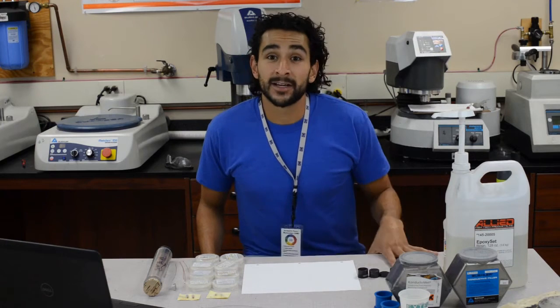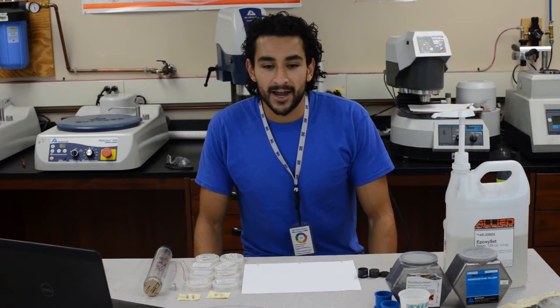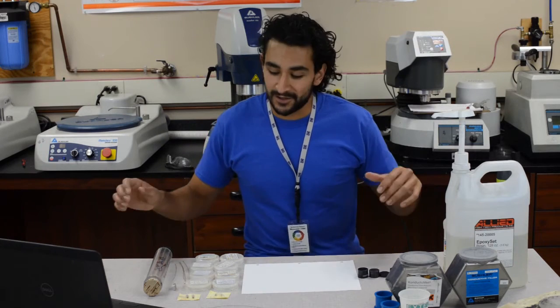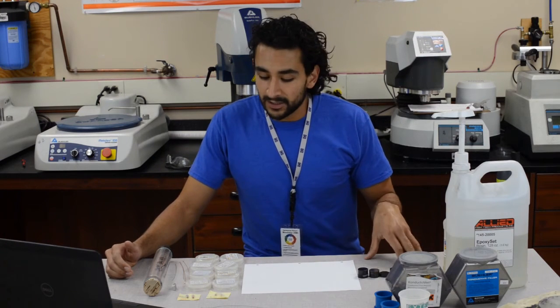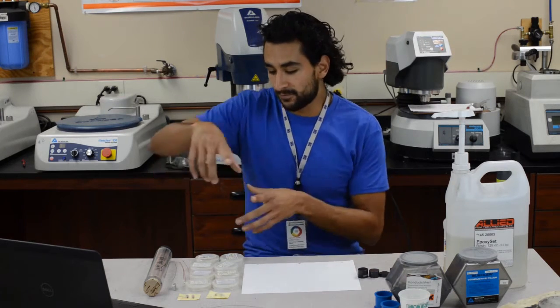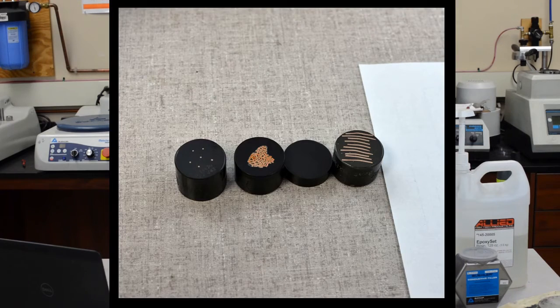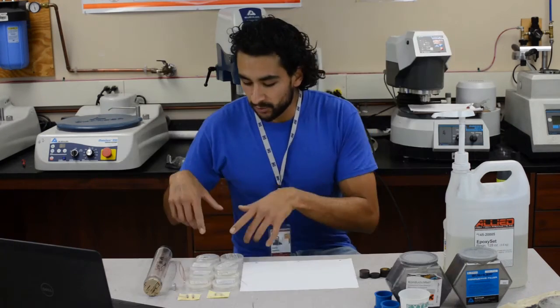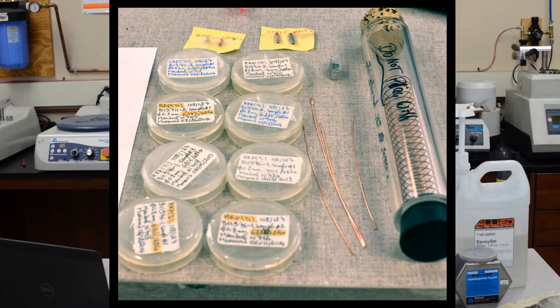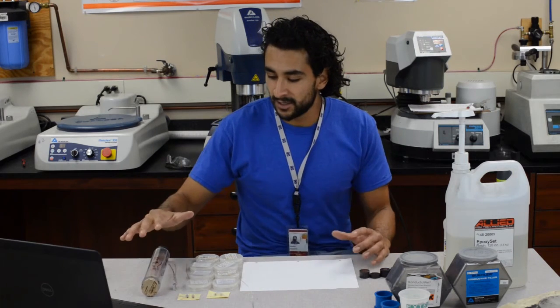Hey guys, my name is Charlie Sanabria. I am a graduate student at the Applied Superconductivity Center. And if you're watching this video, it's probably because you've been hired to perform some metallographic samples. Right now in this video, I will walk you through step by step on how to go from all of this that you see right here to this that you see right here. So what are these things? These are what we scientists call samples.